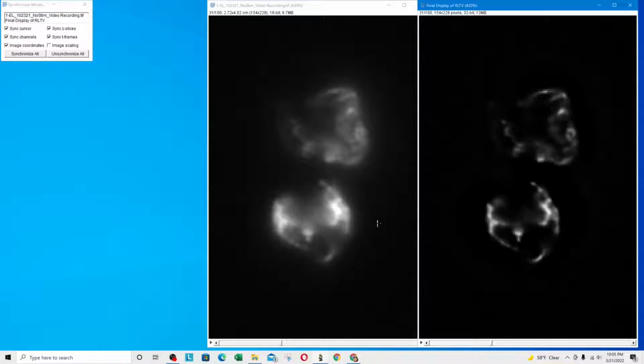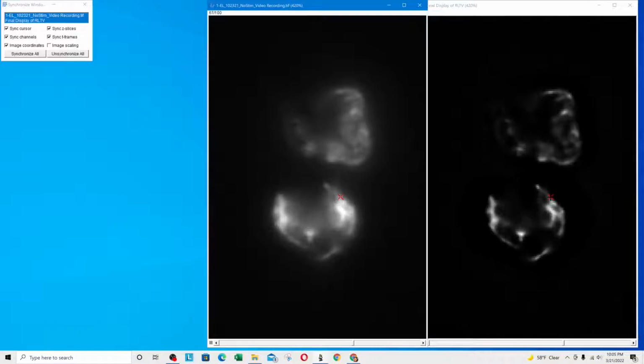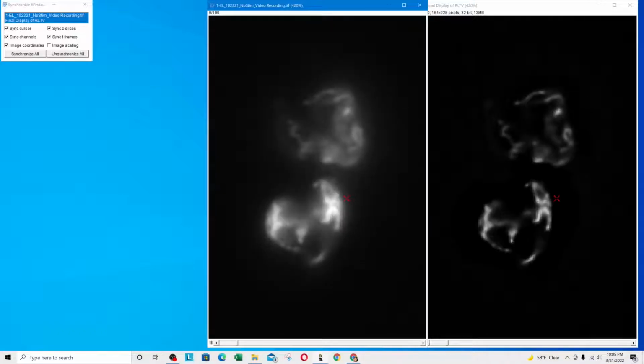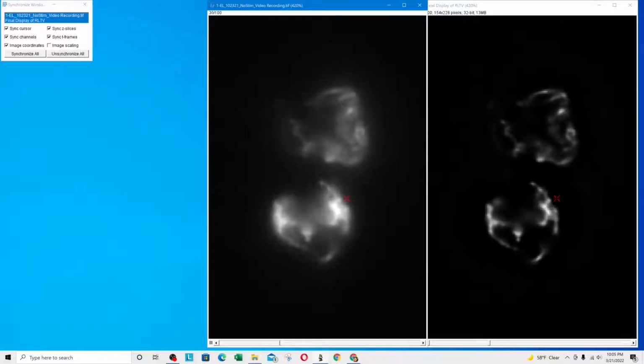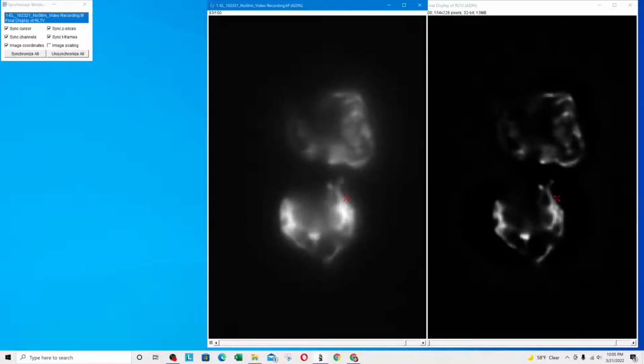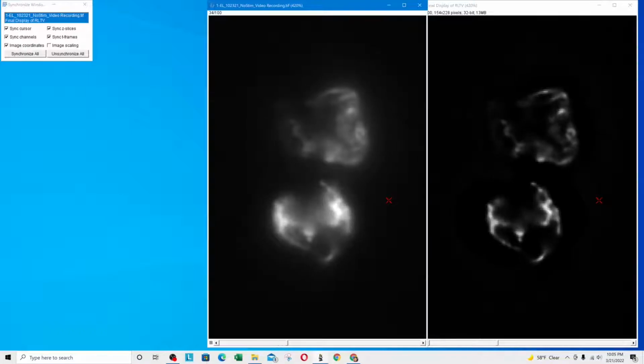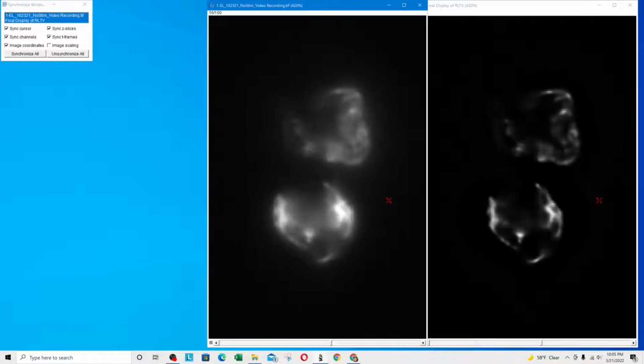Now, in my case, I am interested in analyzing the dynamics of the mitochondria: how they are changing, at what rate they are coming together and falling apart, in which polarity they are moving, and is the motion circular, counterclockwise, clockwise, and all kinds of other things.